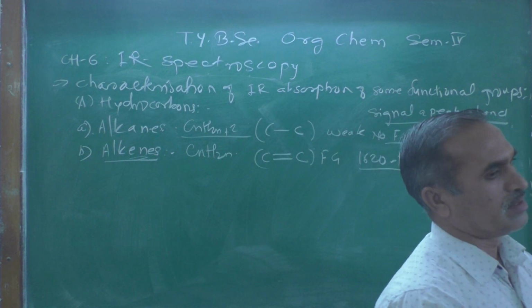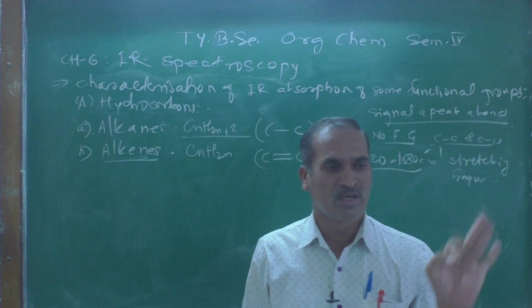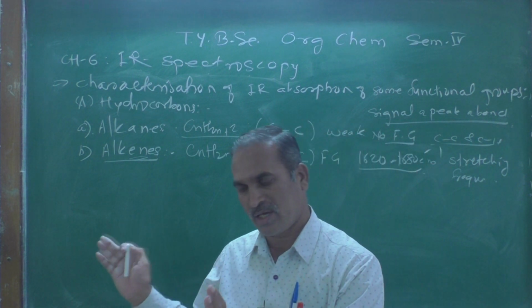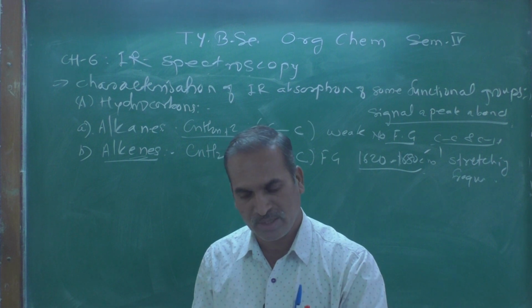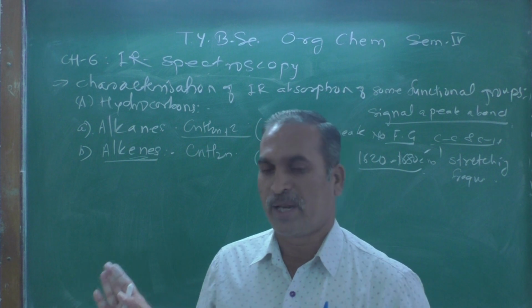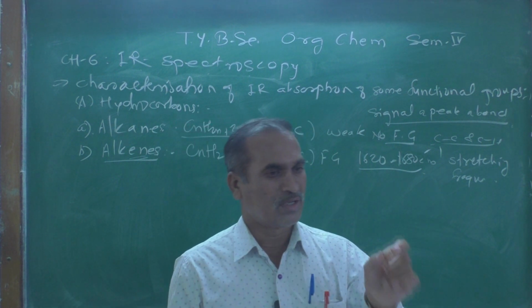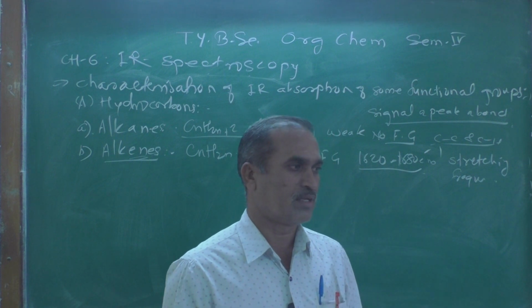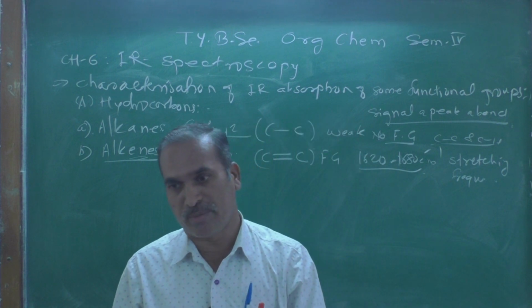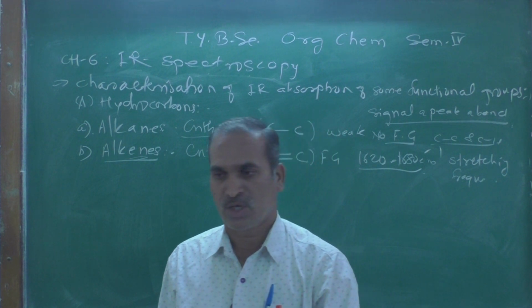These peaks clearly indicate the presence of a carbon-carbon double bond in the organic compound. Understood this one? This is a very clear-cut explanation.